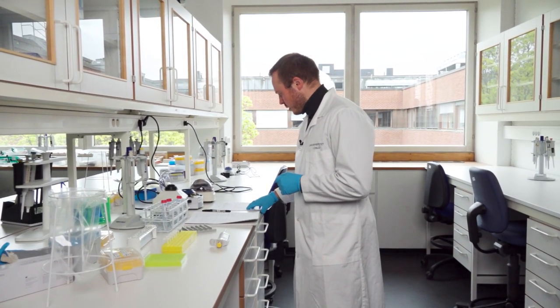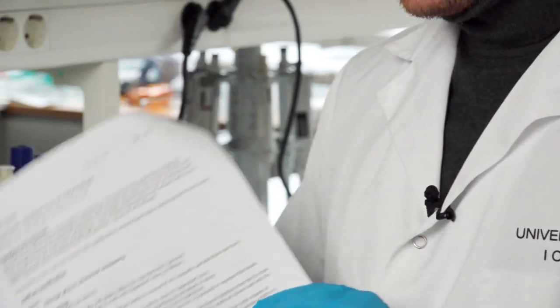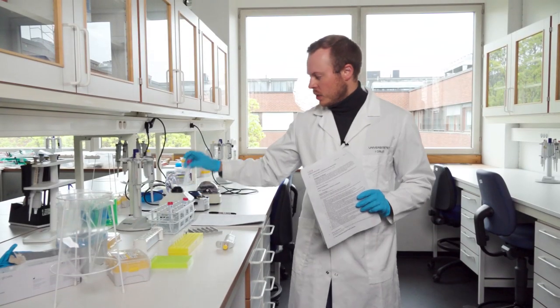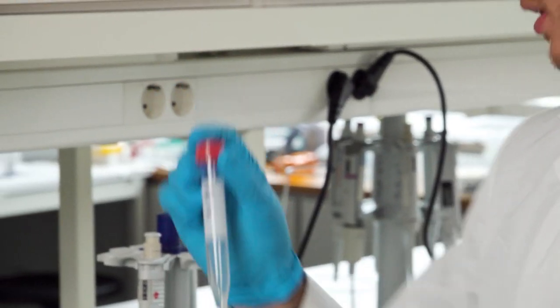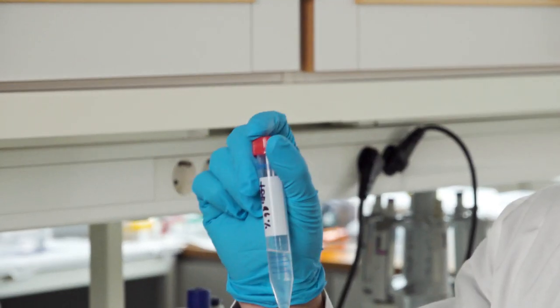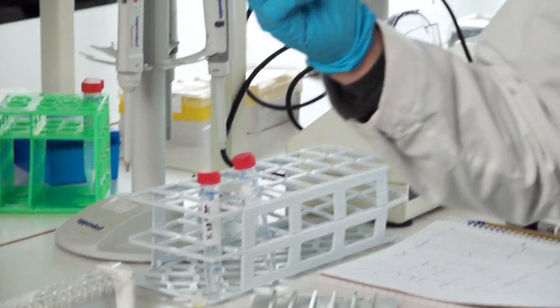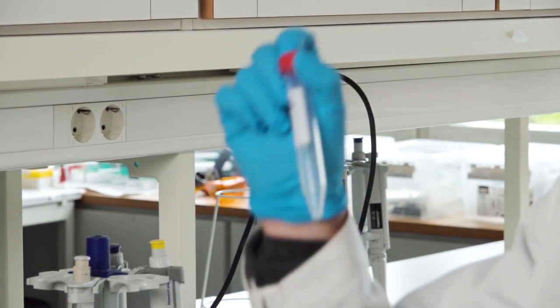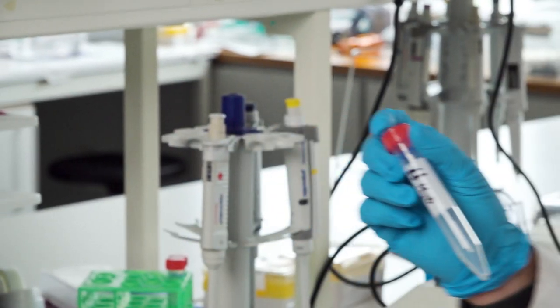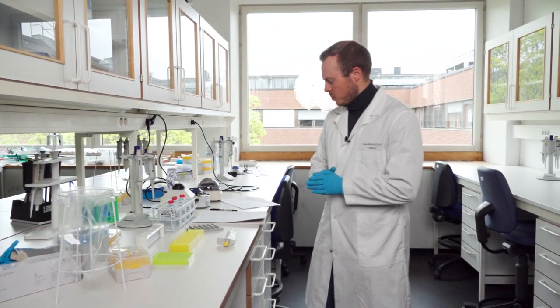Before you start, read the appropriate protocol. It states clearly what you need. One of the most important things is that you need 85% ethanol — to mix it, take the required volume of 96% ethanol and add the right volume of water to get the correct percentage. It's important to use very clean, PCR-grade water so you don't add any contaminants.